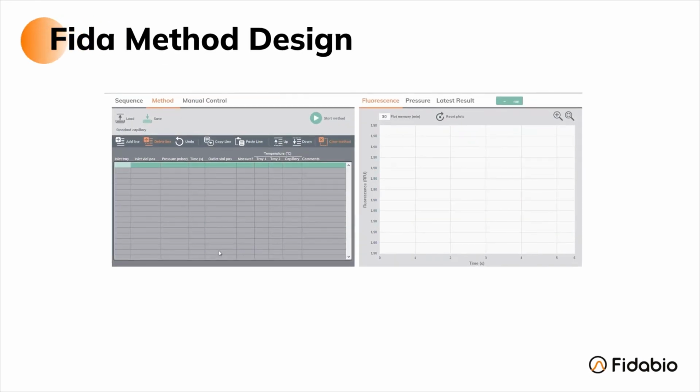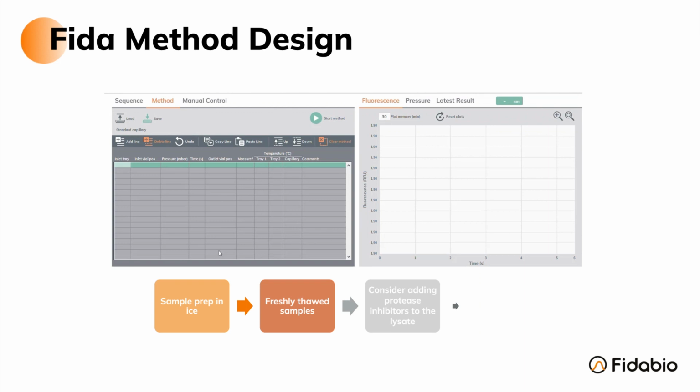To make sure your assay is robust and reliable, please note that the solubilized crude membranes are usually unstable, so it is important to keep them on ice during sample preparation, use only fresh thawed samples, consider adding protease inhibitors to the lysate, and keep the instrument tray 1 at 5 degrees during the running time.